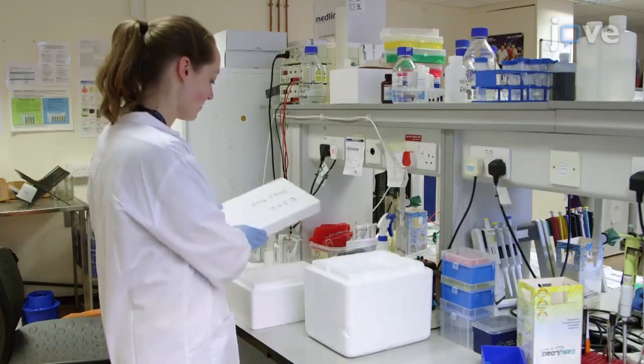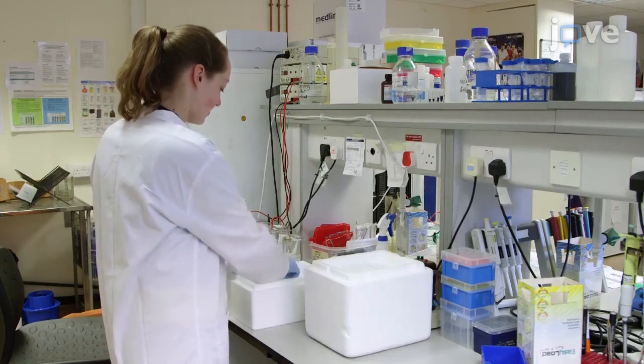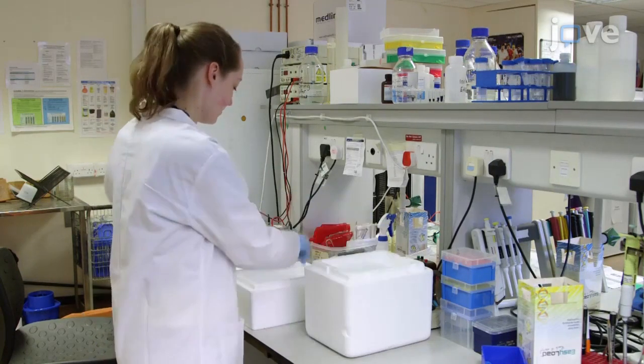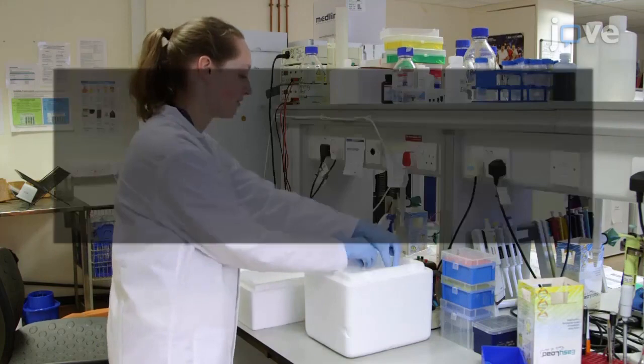To extract proteins from snap frozen cell or tissue samples, thaw the minus 80 degree samples on ice before washing the samples as appropriate, according to the table.